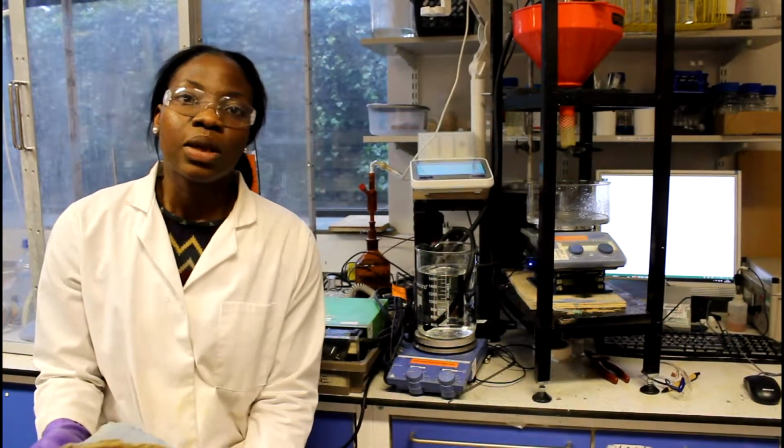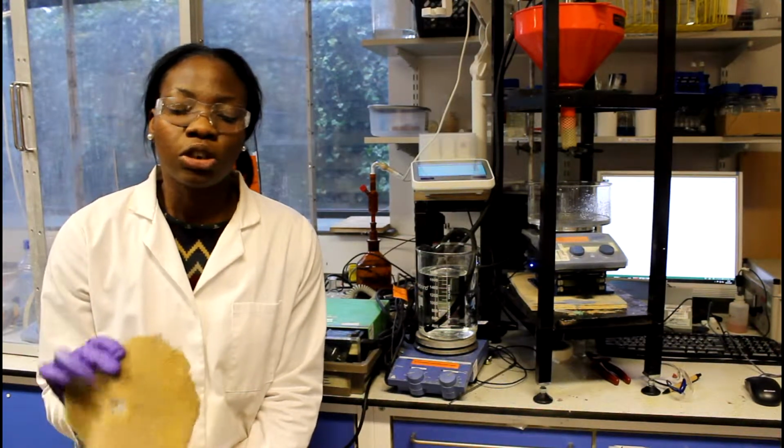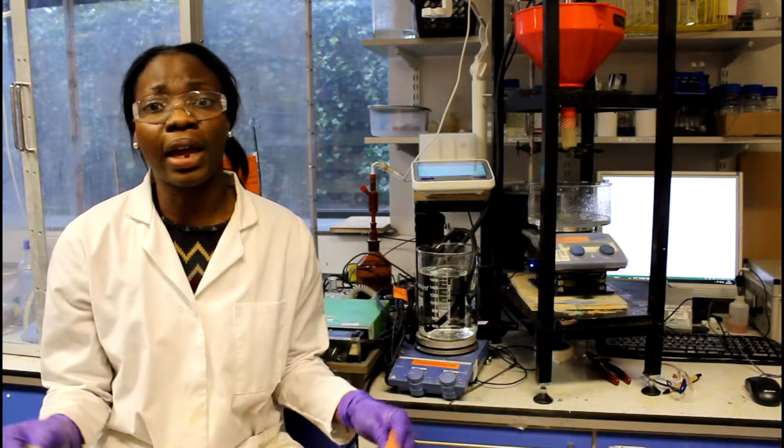So in this video we're going to be looking at a spinning cloth disk reactor, which is a piece of cloth added to the spinning disk reactor. In this case we're using a spinning cloth disk reactor for enzyme reactions, so the cloth contains immobilized enzyme attached to it. I'm looking at nylon cloth and I'll be investigating the effects of using different types of nylon material.